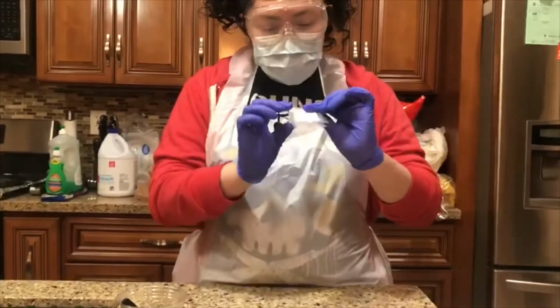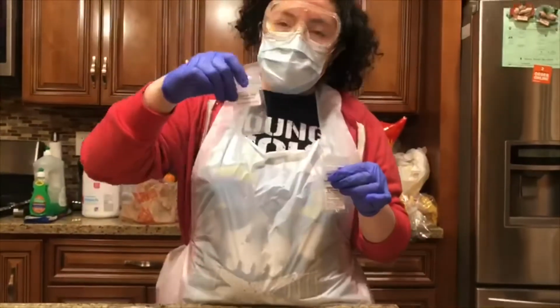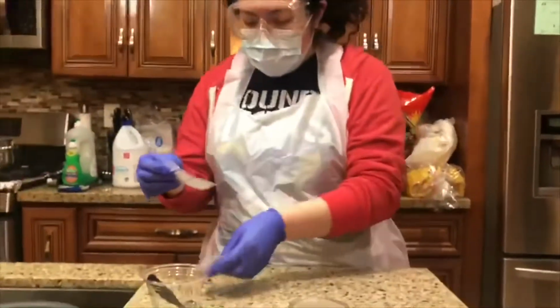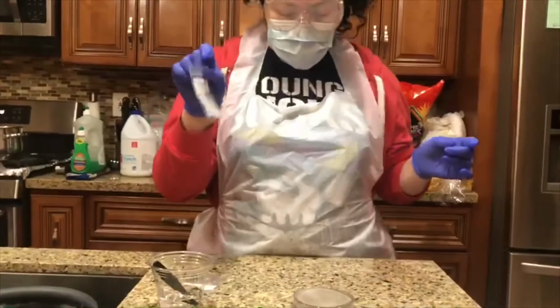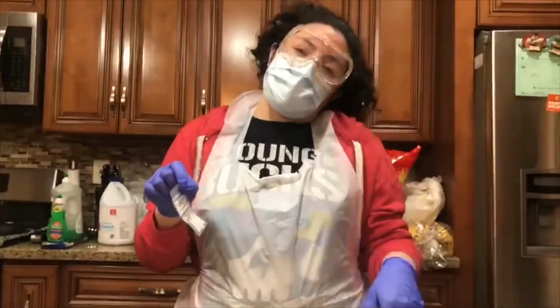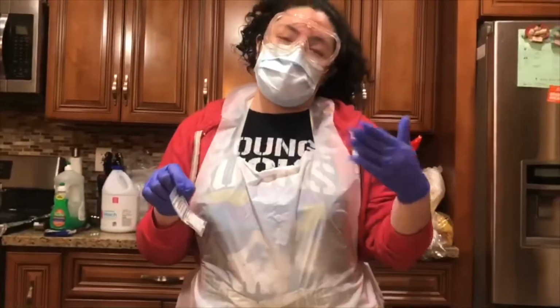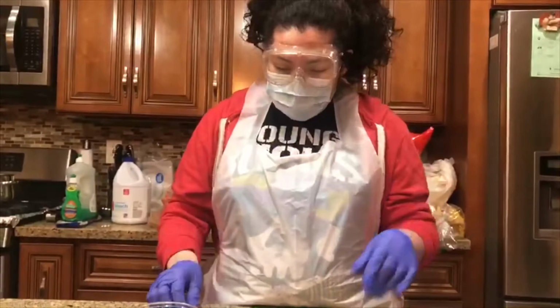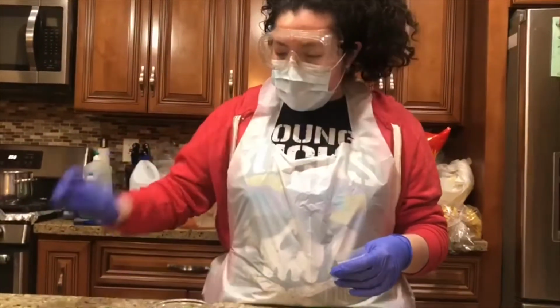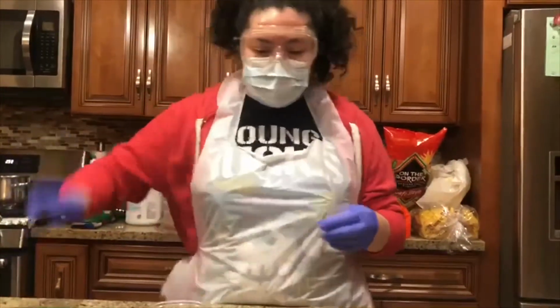I have the penicillin, the novobiocin, and then the gentamicin. So I'm going to show you how to do the penicillin. I'm going to place this one first to its corresponding spot, and after I put the tweezers back in the alcohol, wait 30 seconds, and then do the second antibiotic, and then do the same thing for the third antibiotic. All right, so get my tweezers. I'm gonna shake, make sure it's dry.